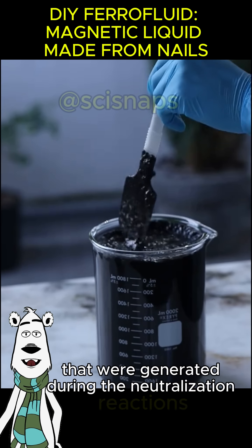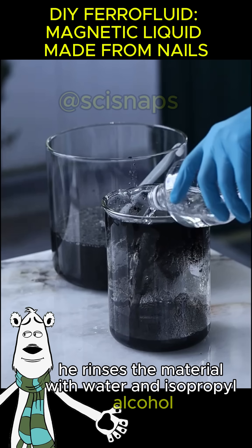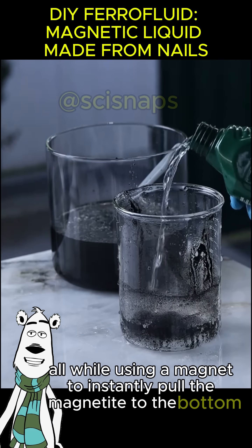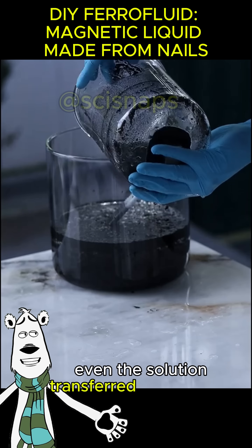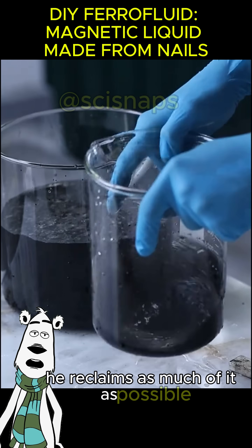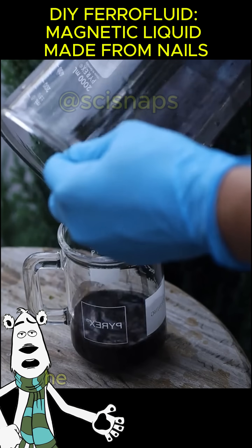He rinses the material with water and isopropyl alcohol, all while using a magnet to instantly pull the magnetite to the bottom. Even the solution transferred to the other container is not wasted — he reclaims as much of it as possible.